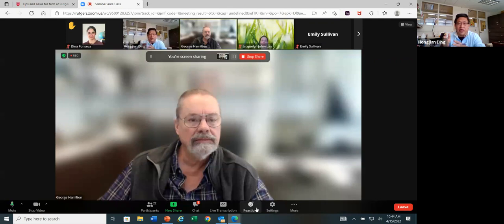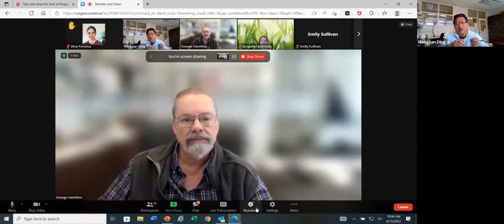We take the image, and that image has never gone into the system before. We call it the training set and testing set. Like if we have 30 specimens, 15 for training the system, another 15 for testing the system.